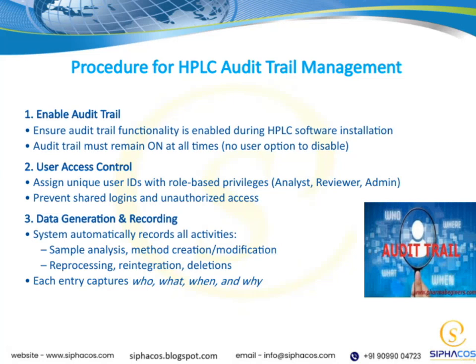Let's talk about the key procedures for effective HPLC audit trail management. First, it's crucial to enable the audit trail feature during the software installation. This ensures that all activities are automatically recorded right from the start. And it's important to remember that the audit trail must stay on at all times. There's no option for users to disable it, which helps maintain the integrity of the data.